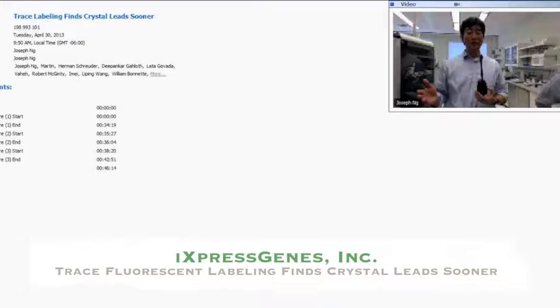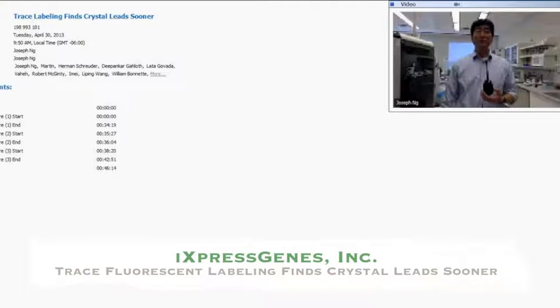Can you see the probe in the electron density map? Well, that's a very good question. That's a very common question. As I mentioned before, the ratio is so low, and when the structure is solved, you just do not see any electron density for the probe. We've done it many times.